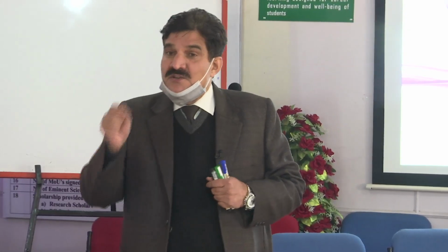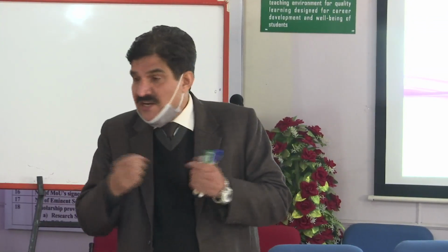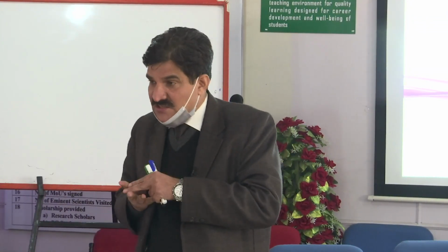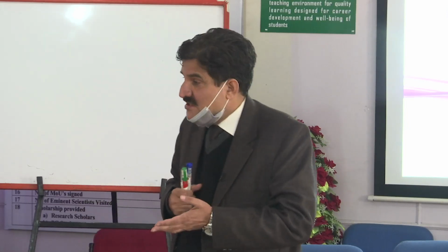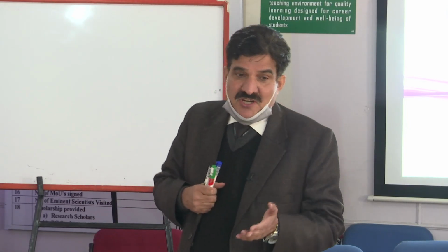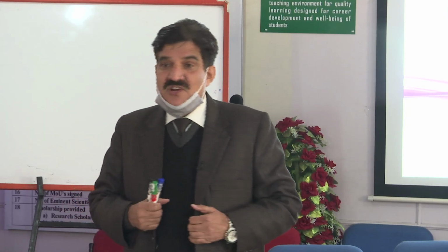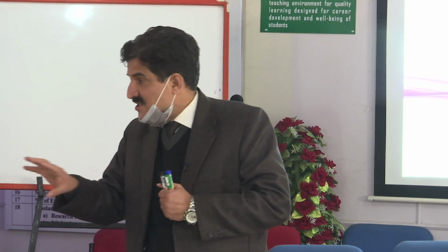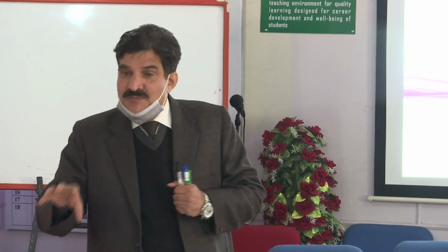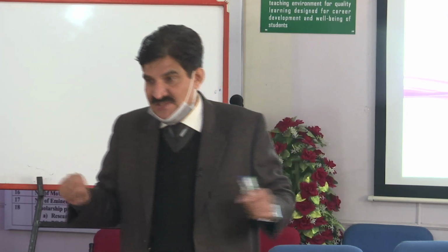Second, we require something else which ruptures your cell wall or cell membranes later on. That can be achieved by detergents. Detergents can be positively charged like CTAB. Detergents can be negatively charged like SDS. Detergents can be neutral like Triton X-100. So any sort of detergent you can utilize, but some specific detergents are utilized for specific purposes.